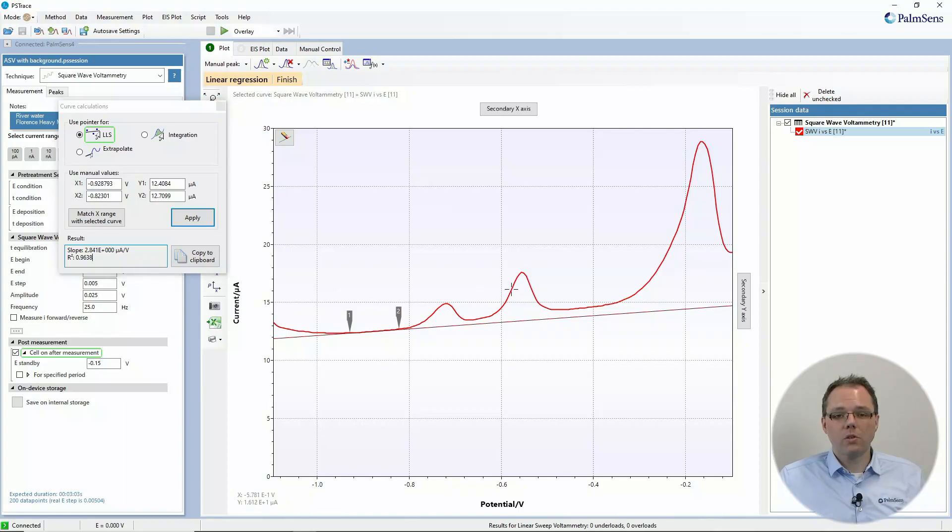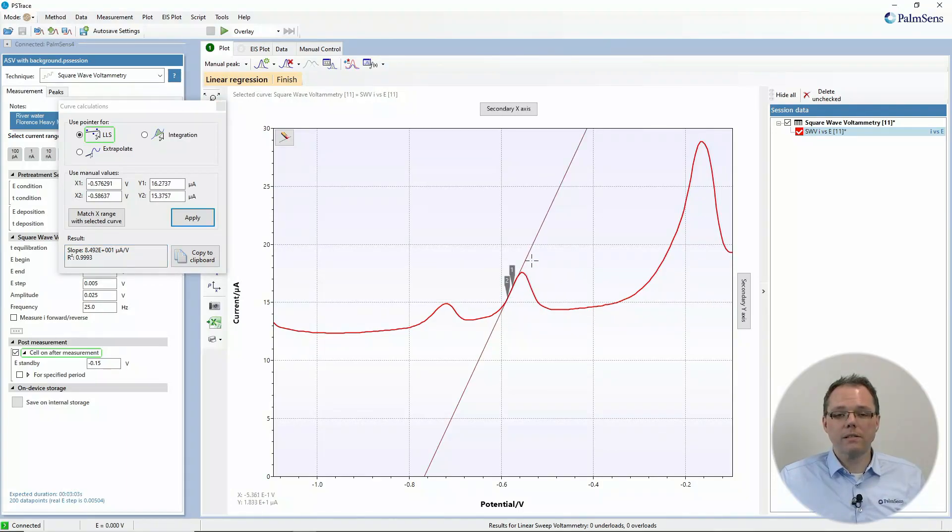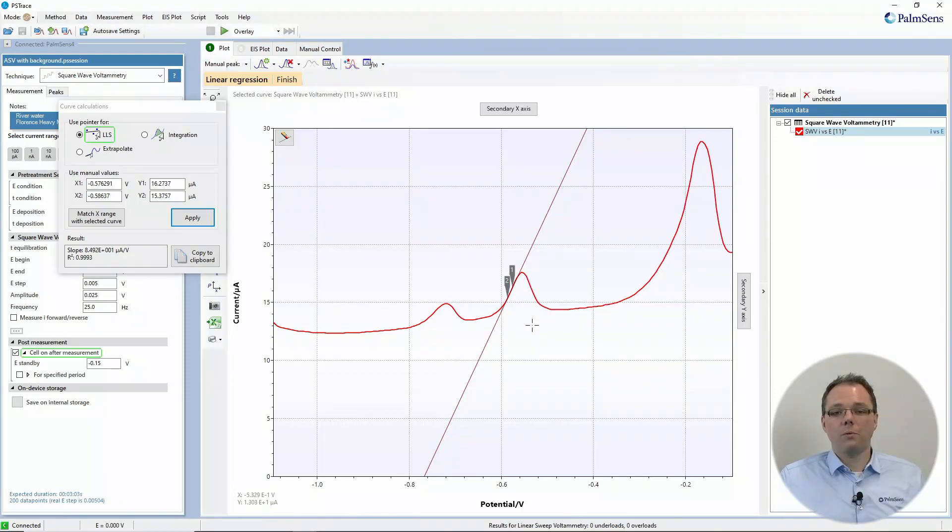And this you can use, for example, to determine slope parts, let's say at the side of your peak to find out how steep is your peak.